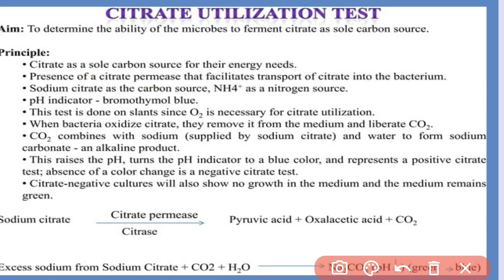The sodium citrate is present in a medium, for example, Simmons citrate medium or Koser's citrate medium. In the same medium, there is a presence of NH4 ions. The medium has an indicator, bromothymol blue.